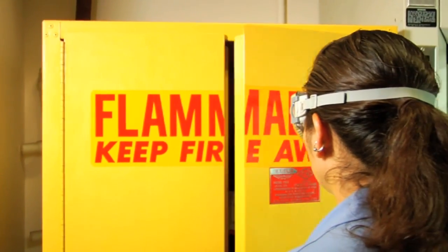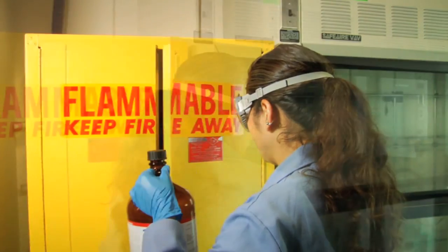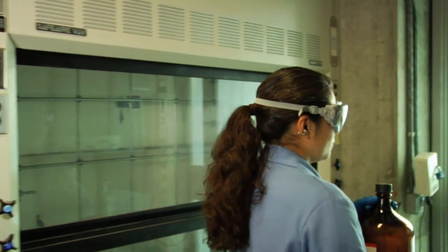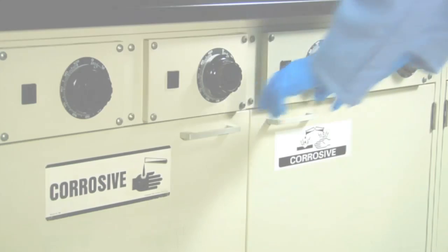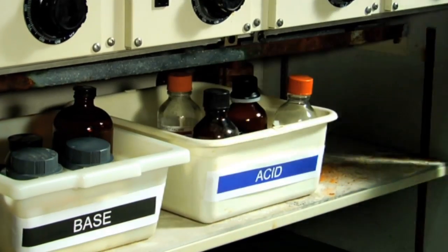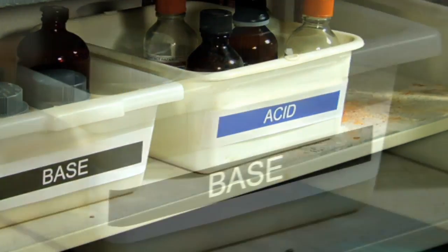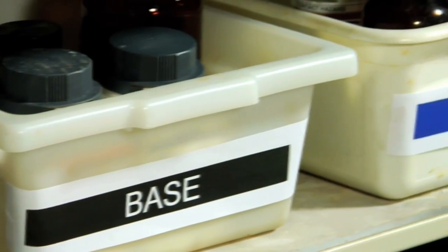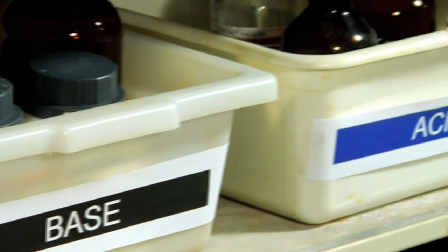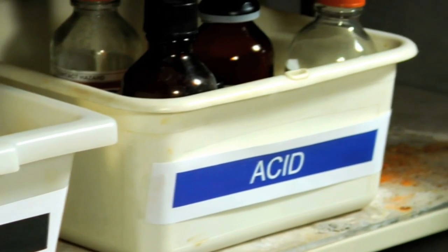Storage of chemicals and flammable or combustible liquids require specific attention. First and foremost, minimize the amounts of chemicals stored, especially flammable and combustible liquids. Acids and corrosives must always be stored in an acid-corrosive cabinet. Store acids in secondary containment, separate from bases. Additionally, organic acids must be stored in separate secondary containment from mineral acids.